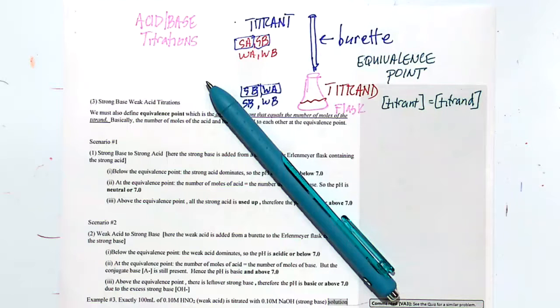Okay. It's a little bit over the 0 mark. One thing I want to tell you guys about the burette, this piece of glassware, is that it's not meant to be very accurate. Titrations you're supposed to do really fast. It's not like, oh, I've got to get it to exactly 0.5 mils. No, it's like zoop, okay, zoop. You'll see.